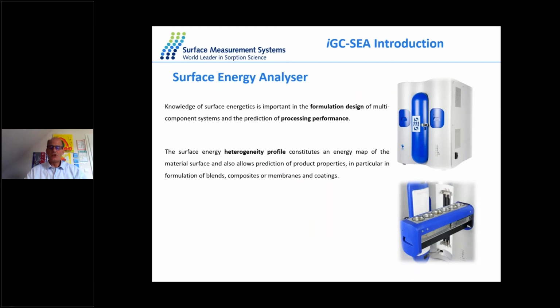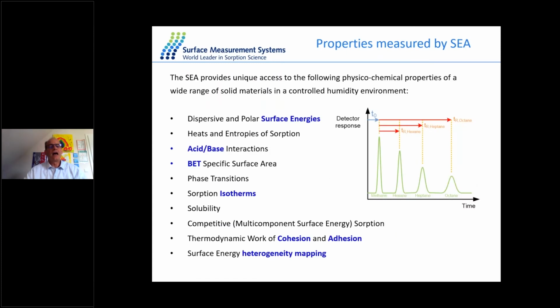So here you see the surface energy analyzer. It is based on IGC, or inverse gas chromatography. What you see on the right side is the instrument. In the middle, you have an oven where you place your samples, and you put different liquids and organic molecules in those reservoirs, and also water and organic molecules. What you're looking at is the retention time.